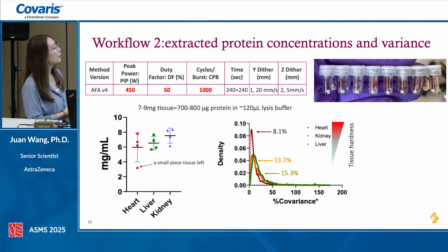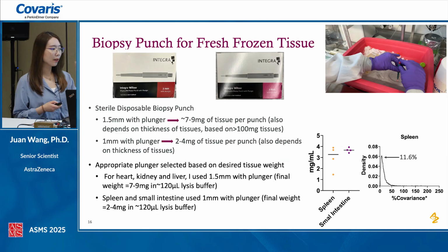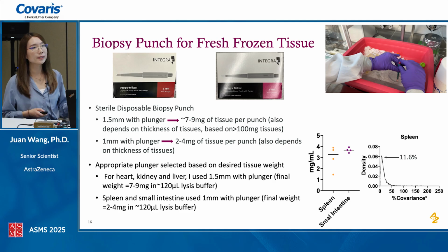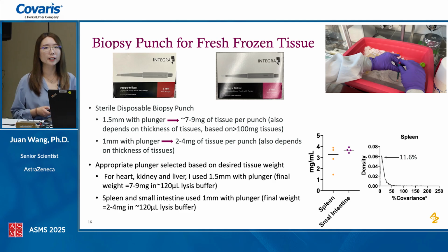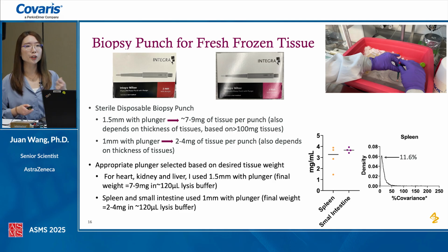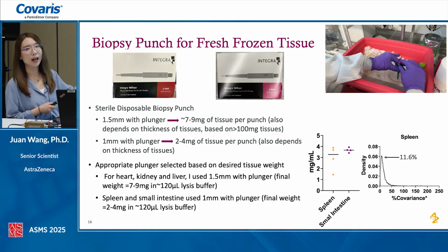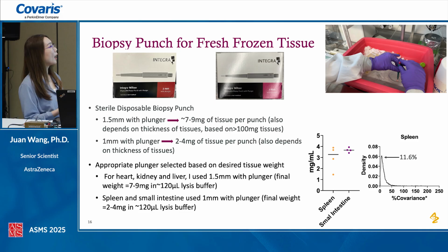So that's one. Then another concern is how you can cut this small piece of tissue without using a knife, and also give us very consistent replicates of similar mass. So we also tried using a biopsy punch for the fresh frozen tissues.